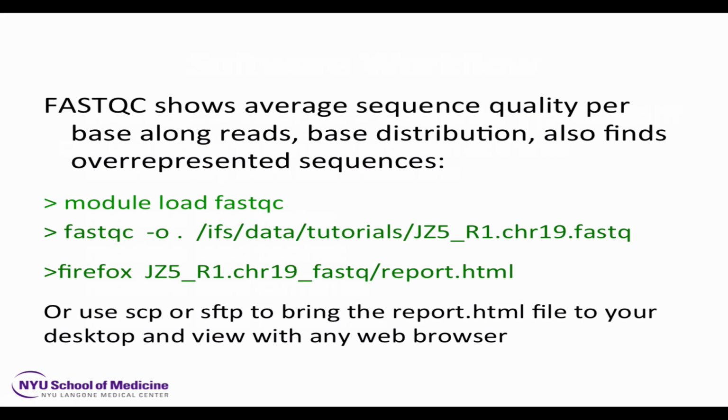I'm just not going to spend the time. Just be aware that these tools exist and you could learn them yourselves, or you could take another bioinformatics class or meet with a bioinformatics consultant and learn how to do more in-depth quality analysis on your RNA-Seq runs.